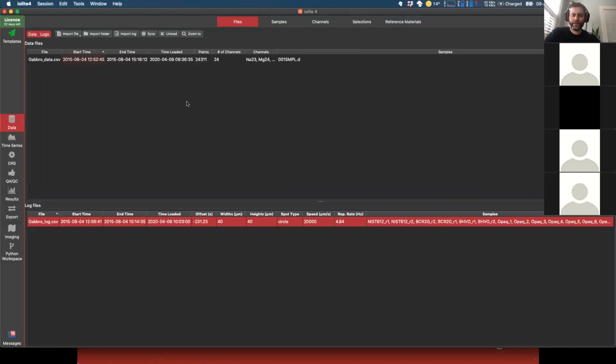Okay, that sounds like the log file is corrupted when you've downloaded it. Yeah, you can just download it again and it should work. Did you open it by any chance in Excel? Because Excel will corrupt the data, the timestamp format. And it'll do that without telling you. So this is just general for everyone: if you do open your data files in Excel, it may automatically change the date formats without telling you, which is pretty shocking.